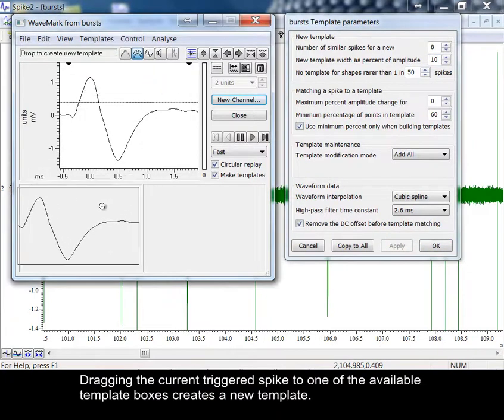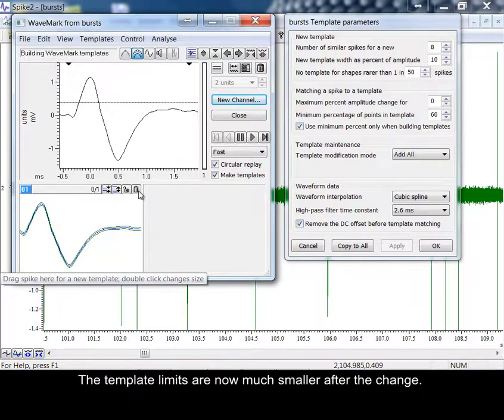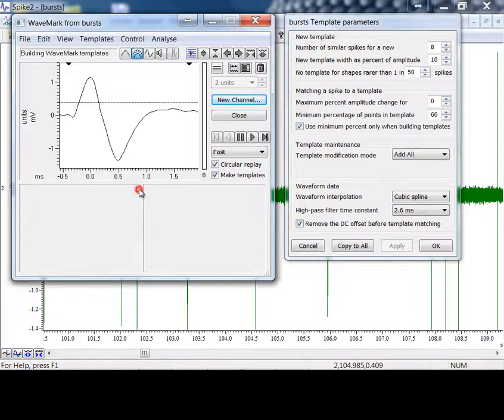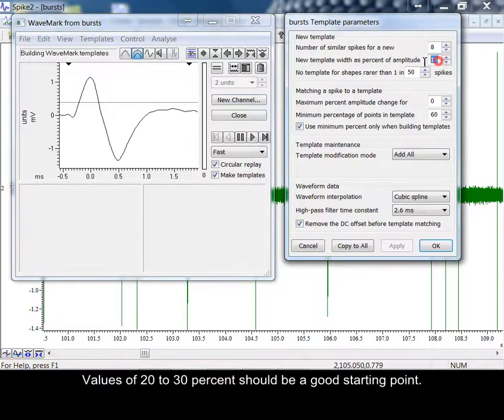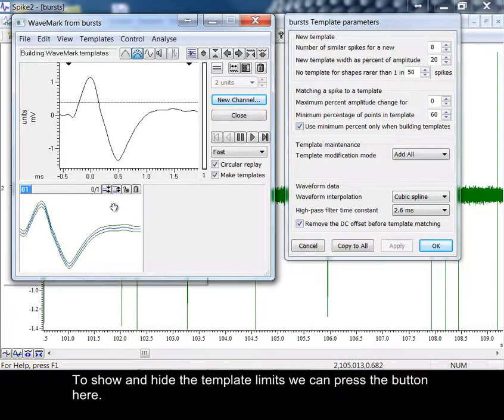Dragging the current triggered spike to one of the available template boxes creates a new template. The template limits are now much smaller after the change. Values of 20% to 30% should be a good starting point. To show and hide the template limits, we can press the button here.